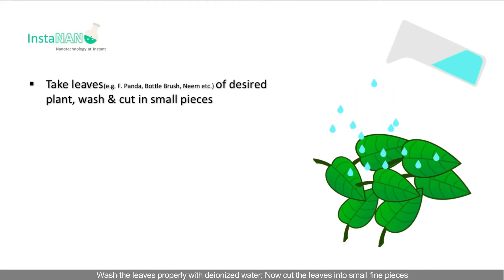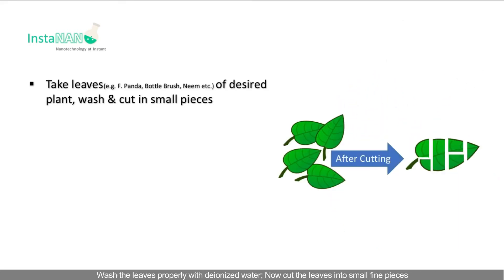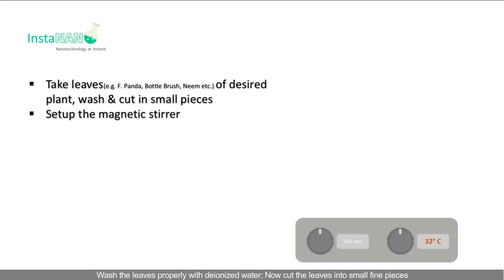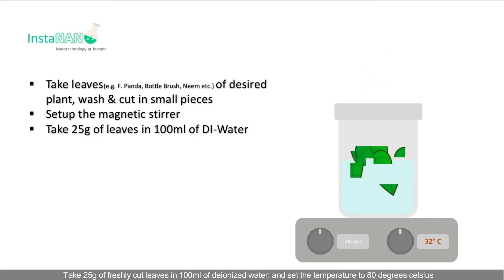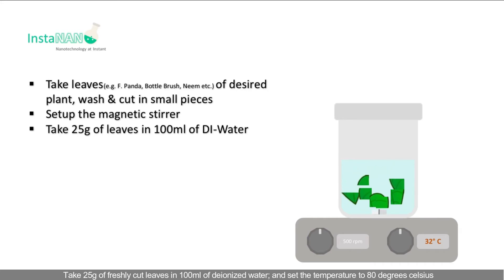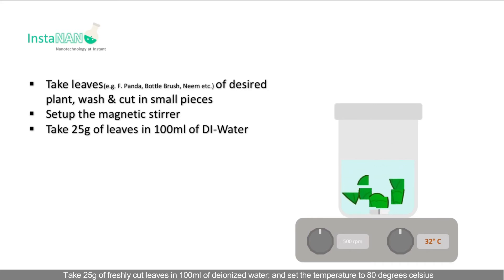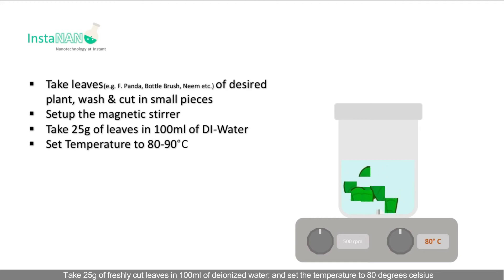Wash the leaves properly with deionized water, then cut the leaves into small fine pieces. Set up the beaker on the magnetic stirrer. Take 25 grams of freshly cut leaves in 100 ml of deionized water and set the temperature to 80 degrees Celsius.